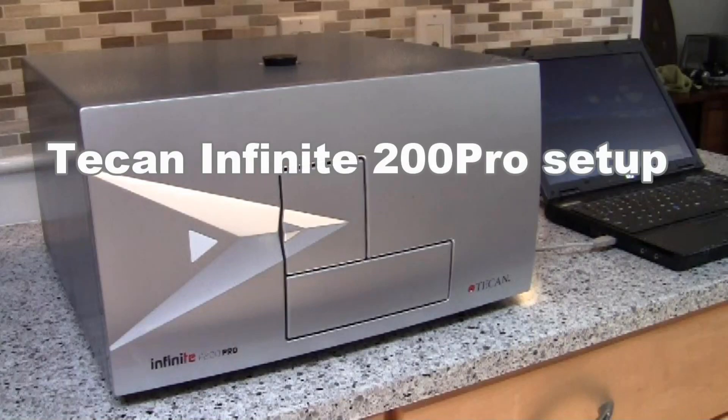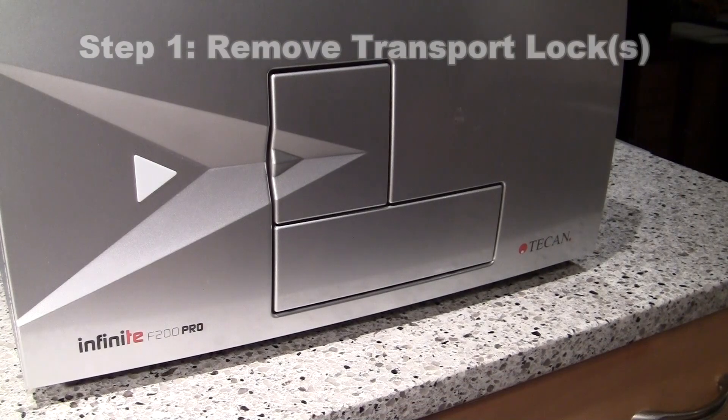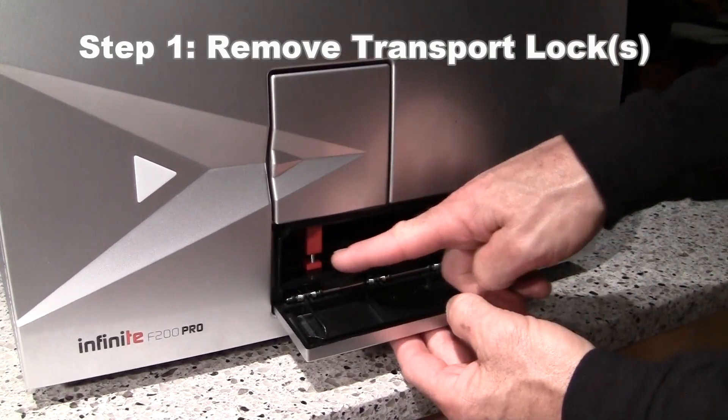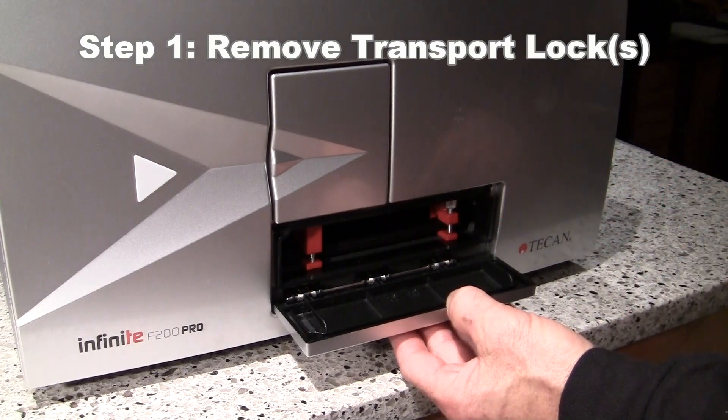This video will show a quick setup for the Tecan Infinity 200 Pro Microplate Reader. Step 1 will be to remove the plate transport locks. You can access the transport locks here through the plate transport compartment door.